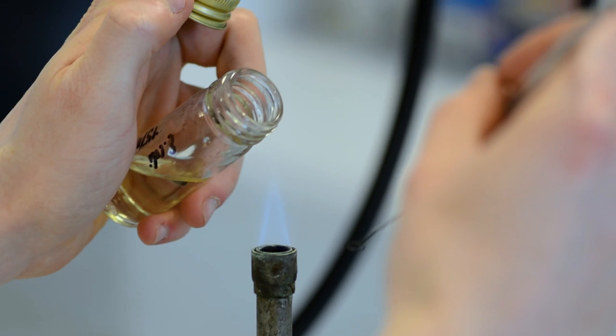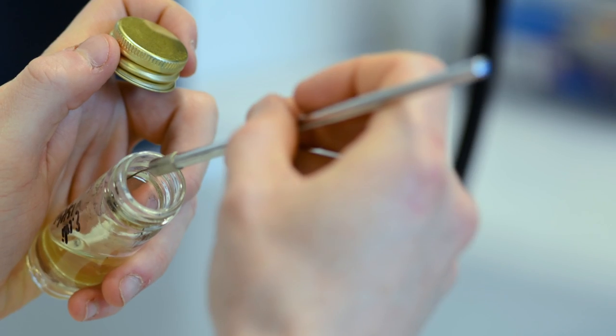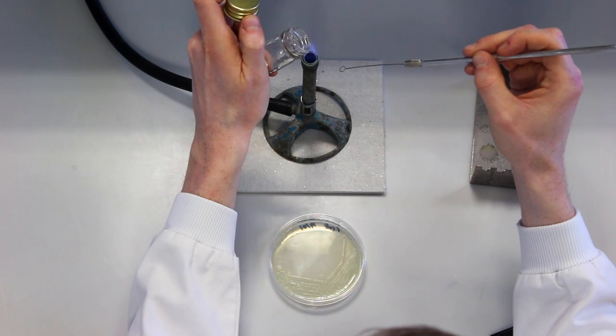The bottle is slightly tilted and the inoculum on the loop is rubbed onto the inside of the glass bottle, so that when the bottle is upright, the inoculum is submerged.